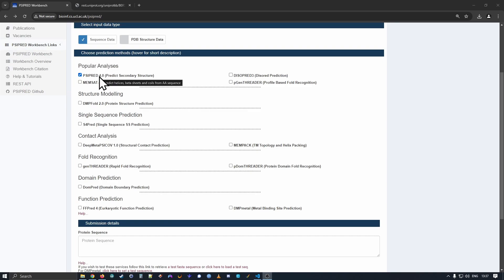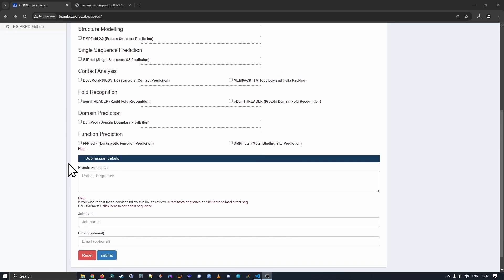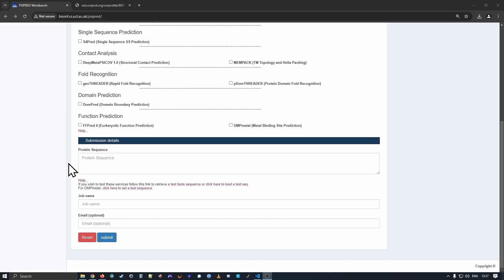If you hover over any of the names, you get a slightly longer description of what the method does in the tooltip. Moving down, having selected the method we would like to run, we can input our sequence data.